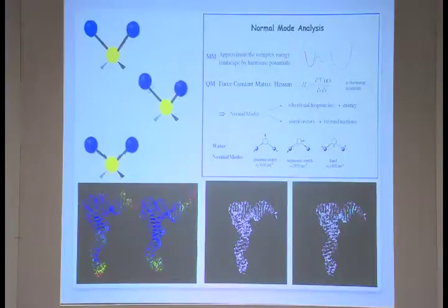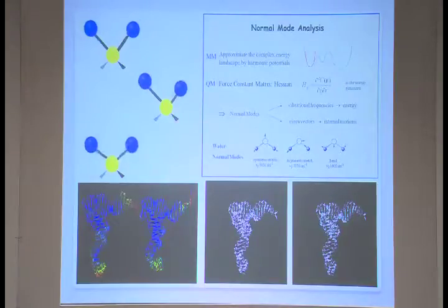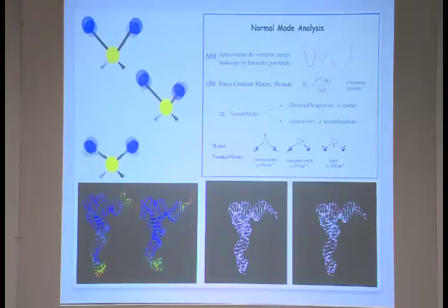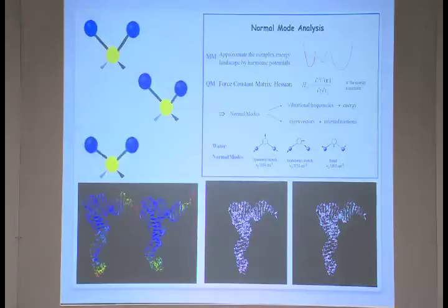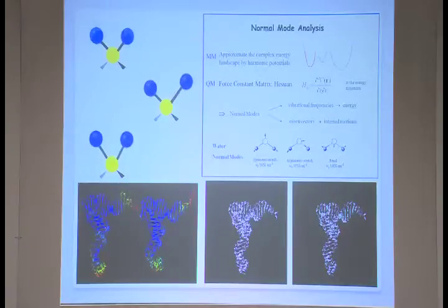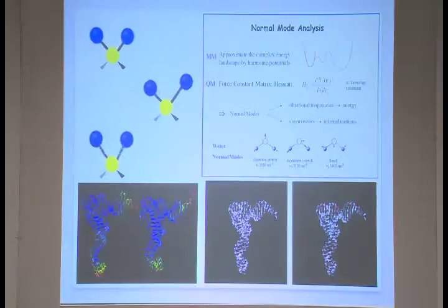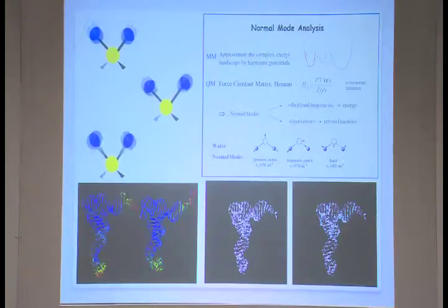And then comes the normal mode based method, where this normal mode, the vibrational modes, as you know. Now, for a big molecule, fitting normal modes is very difficult. So they use a very coarse method, like using a harmonic potential and all this very crude way to model. So definitely it won't give the high frequency normal mode vibrations perfectly.